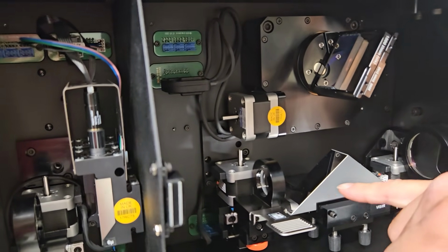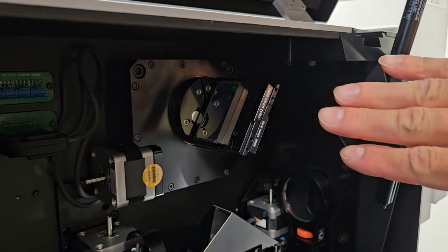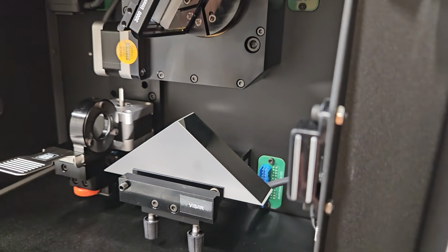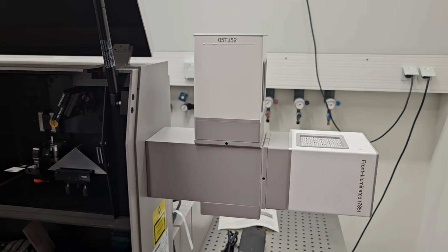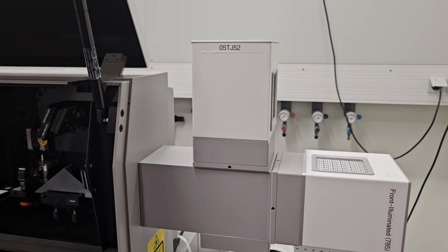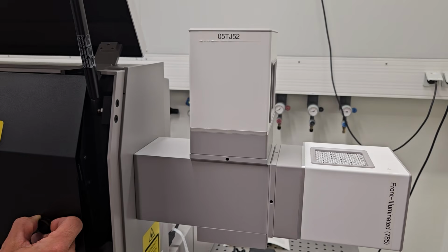The grating works like a prism that spreads the Raman light into a spectrum. Depending on the grating, you can also scan the spectrum a little bit more precisely. The detectors are these 2 there. The upper one is for fast readings and the side one has a better noise to signal ratio. Both of them are CCDs cooled to -50°C.